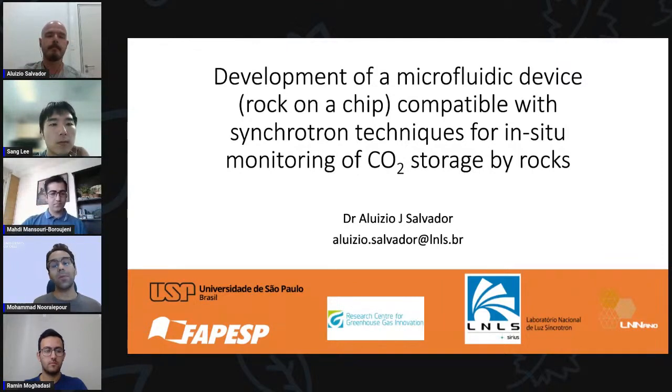But do you have any idea about the time scale of these reactions? No, I mentioned that we are in the very beginning of these experiments. I didn't show it here, but we started with bench experiments, the bench tests, before going to the beamline.